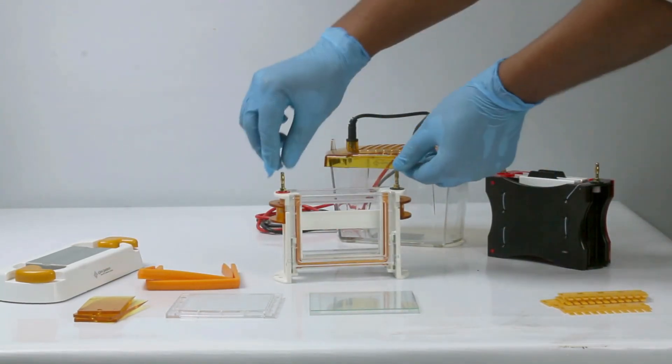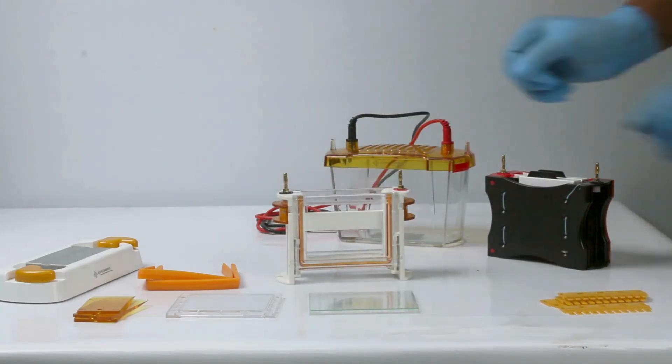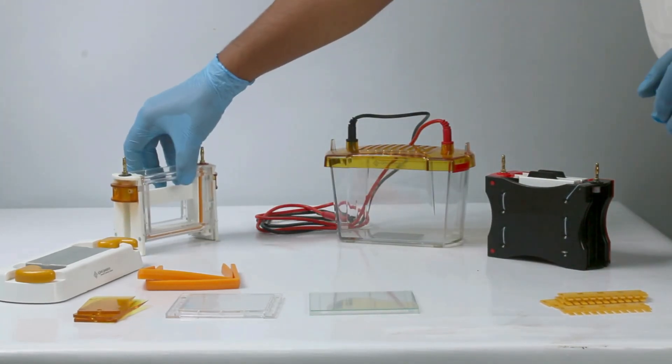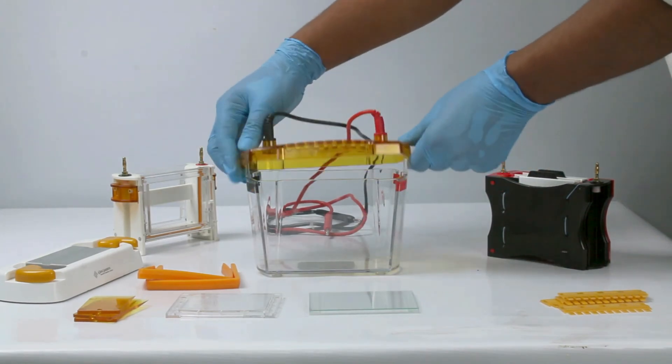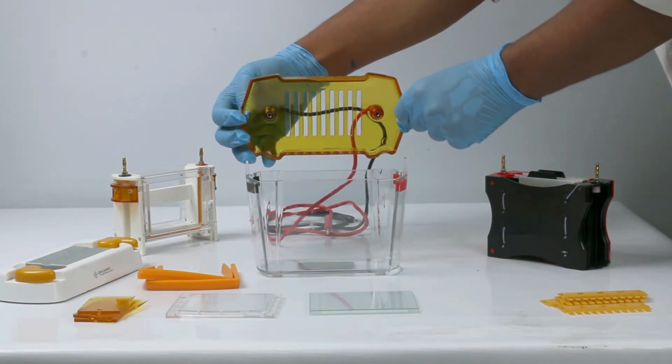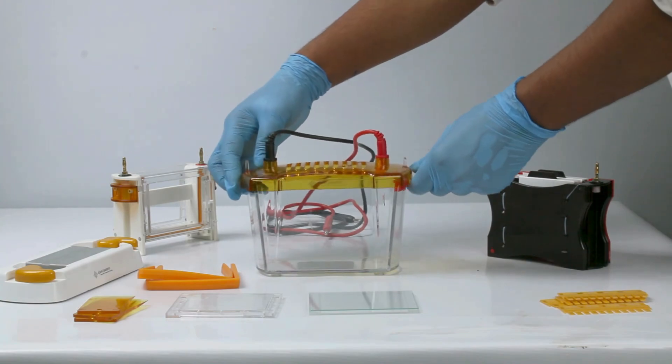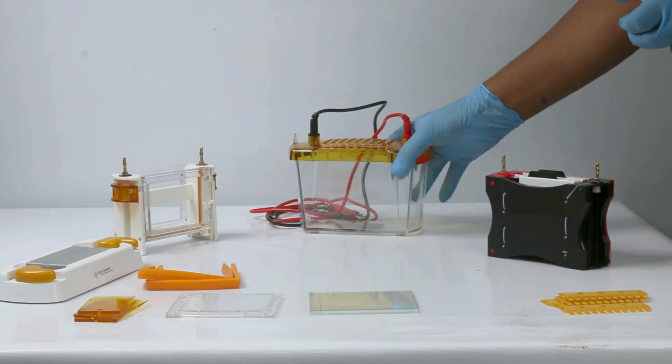Let us discuss the electrophoresis apparatus. The electrophoresis bracket holds the glass plate during gel casting and running. Here is the electrophoresis tank equipped with color-coded electrodes: black for the negative terminal and red for the positive terminal.